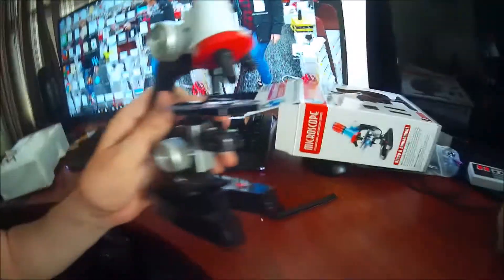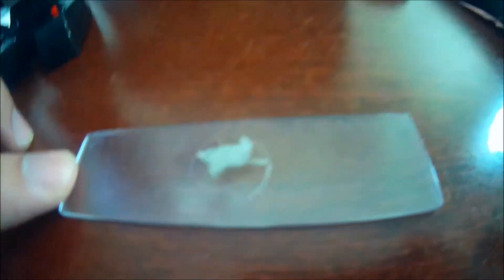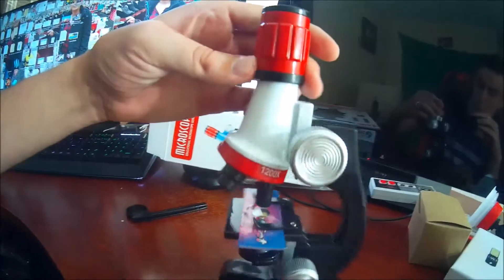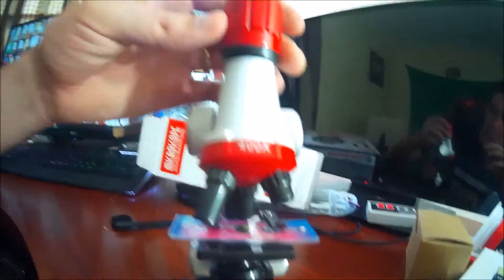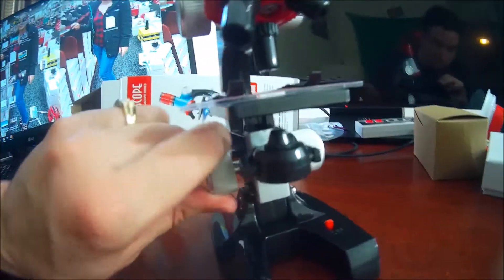Now if you guys got AAA batteries, what you can do is put two down here, flip this switch, and it's going to put a bright light up through here to make viewing even easier. You also get three — actually four extra trays that are not filled that you can put your own specimen on. You get the plastic ware used for filling specimens and the sample bottles as well. I'm sorry we didn't have any AAAs today — we really wanted to try that light. But even without it, you've seen some incredible stuff in there. Once again, this has a 400x zoom, 1200x zoom, and 100x zoom. And here's the focus up here — this knob moves it up and down along with this right here.